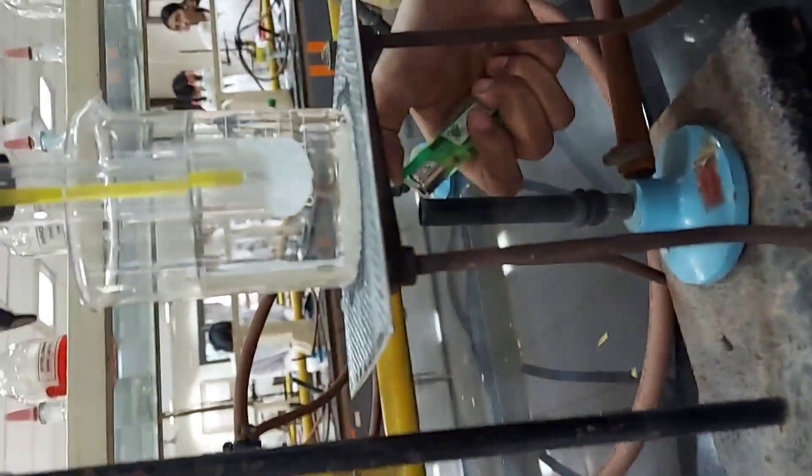Basically, we are removing the turbidity by heating. When the turbidity disappears, we note down that temperature and remove the burner. After that, when the solution cools down, it again becomes turbid and we note down that temperature.